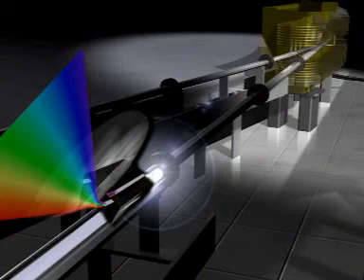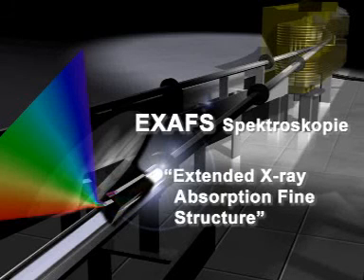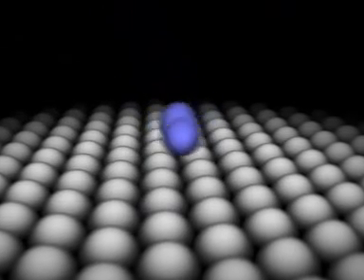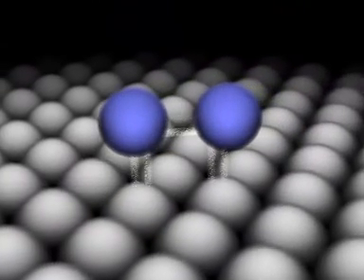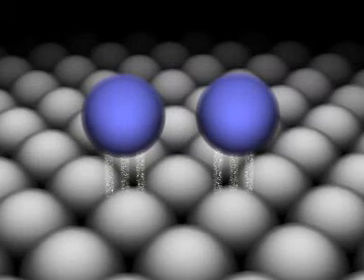A small group of specialists make use of so-called EXAFS spectroscopy, which stands for Extended X-ray Absorption Fine Structure, when they want to determine distances between atoms and the number of atoms. Information of this kind is very much in demand, as for instance a catalyst may become inactive as a result of even minute changes in interatomic distance, or conversely allow conversion into a desired product.